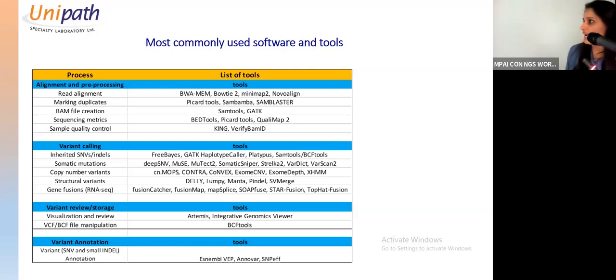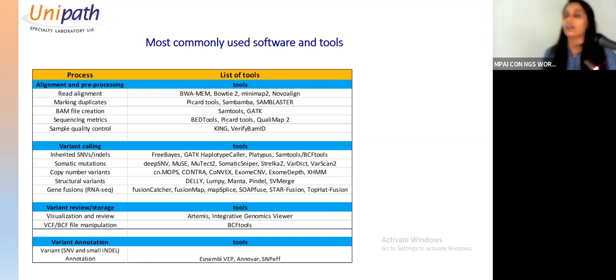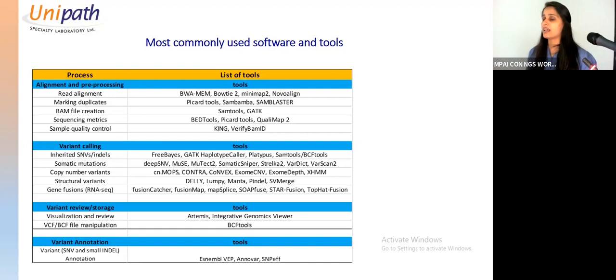Right, and this is for annotation. This is really important, as I said. You get the gene address from the VCF file, but how do you get the variant details? You get that only with annotation, right? So these are the tools which help in annotation. VEP is widely used. You can use it, that is the best tool. For example, if you have got the VCF file from any company and you want to check the variant of your interest, but you don't have complete data with you, you just have a report sent by them, so if you want to do it by yourself, you can use bioinformatics programs and VEP. You can upload your VCF file there and check out the result.